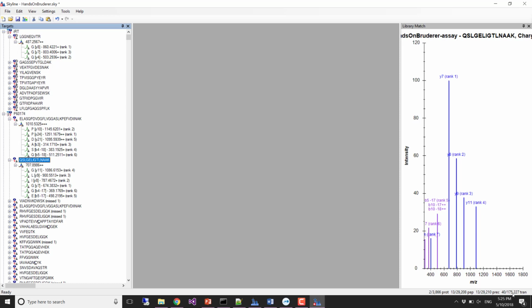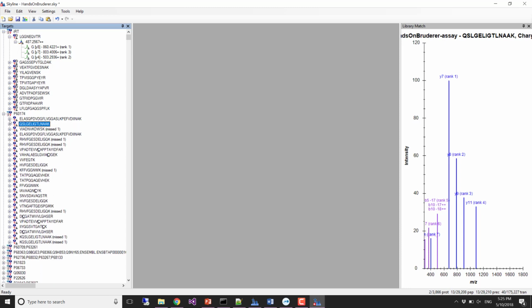It's different from my notes. If you actually look at my notes, you'll see a different number, and that's because I went back and changed 400 to 399, so I actually got those 400 m/z peptides, but most of them appear to have gotten removed because there aren't really that many more transitions. But you can see we didn't lose any proteins. We lost some peptides, a few precursors, and definitely a lot of transitions. Okay, so that is it.